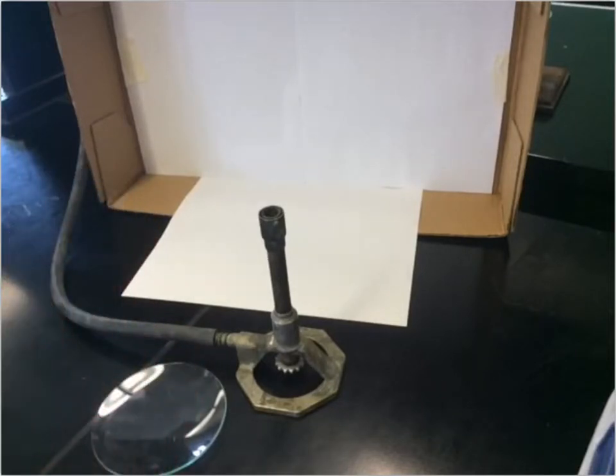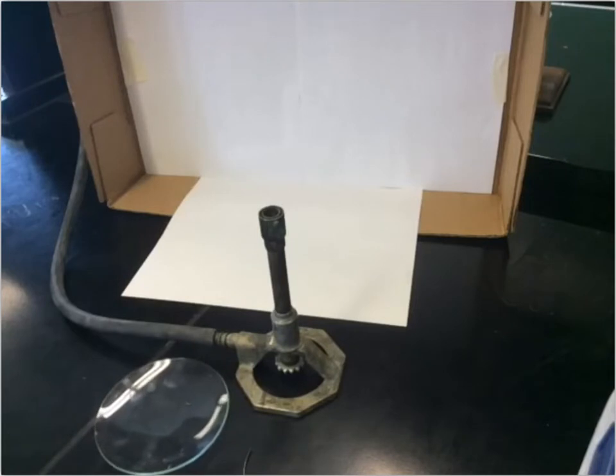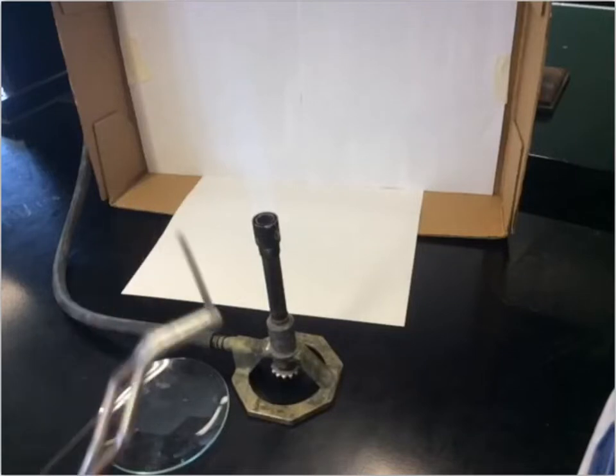That's our magnesium ribbon, just this thin piece of metal. To react it with oxygen I'm going to burn it, putting it in the flame of this Bunsen burner. So I'll light this Bunsen burner — we've got our flame, you can't really see it very well but you can probably hear it.